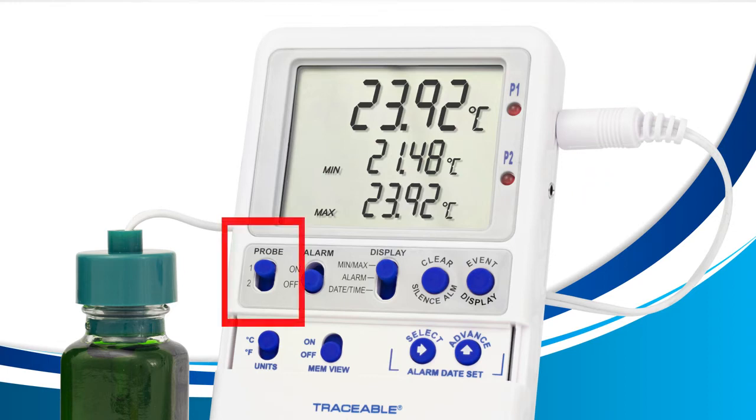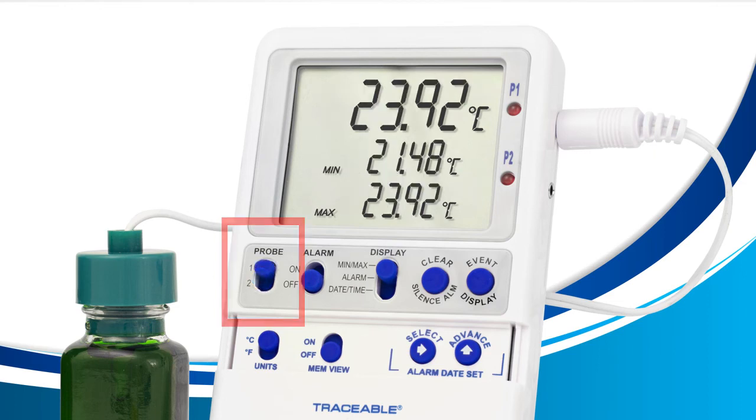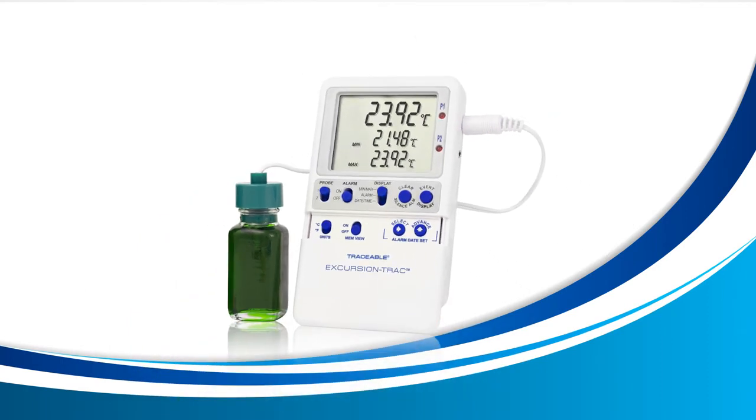If I move the probe switch to probe 2, my device will begin to read LLL.LL as I don't have a second probe inserted into the probe 2 slot. If I move the probe switch back to probe 1, it will begin to work normally again as I do have a probe inside the probe 1 slot. Try this remedy and see if the LLL.LL error goes away.